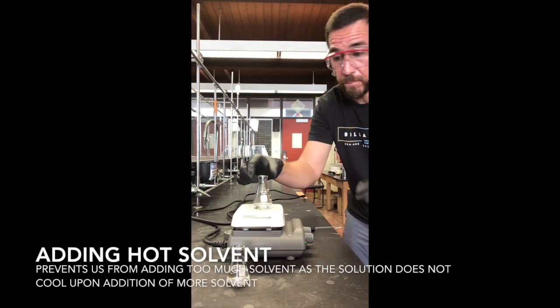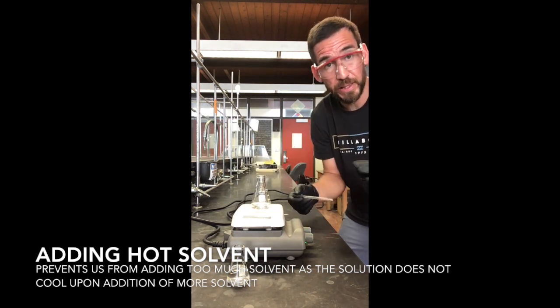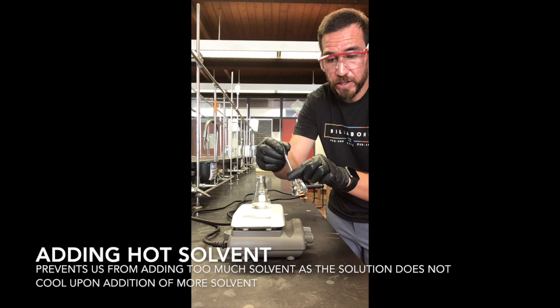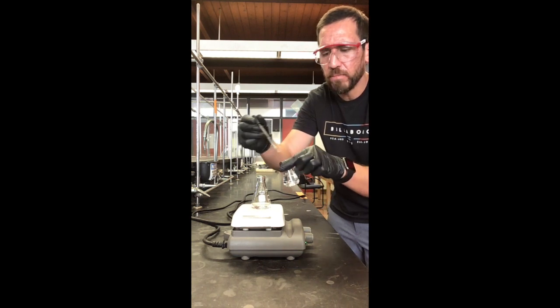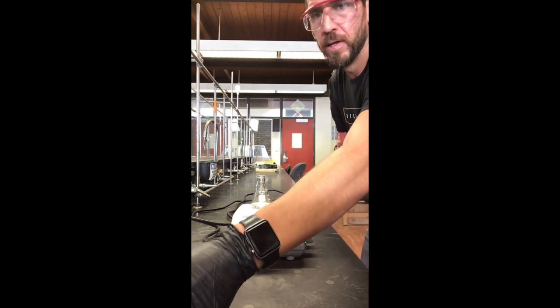And so actually, you know what? In looking more closely at this, there is actually a little bit left in here. So this is perfect because now I get to use my pipette and I will transfer. I'm actually just going to do a couple drops. So 1, 2, 3, 4, 5, 6, 7, 8. Why not 8? I like 8. 8's a good number, right? Let's do 8 drops. Why not?